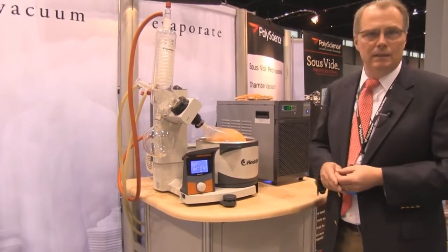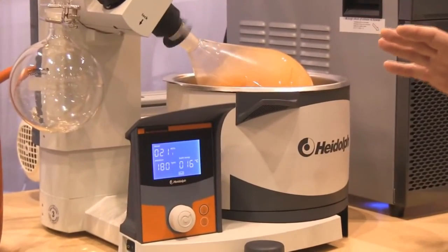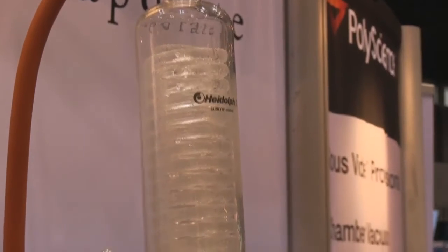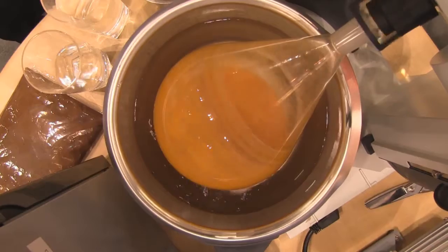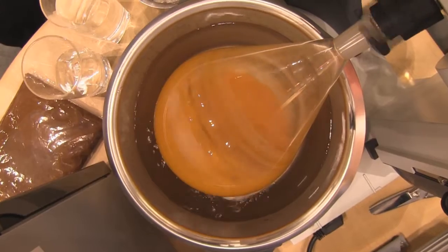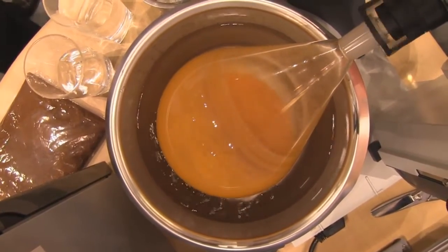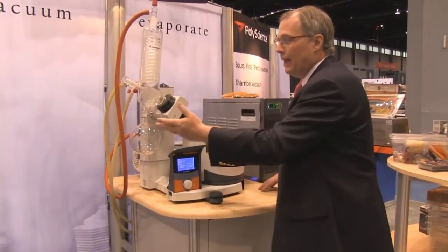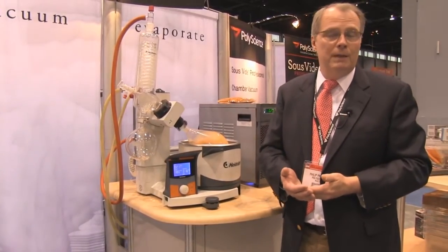Currently I'm distilling some habanero peppers. The system consists of a recirculating chiller that flows cold water through these coils, and a bath that's temperature controlled so you can keep an exact temperature of the product you're trying to distill. And because the whole system is under vacuum, you can boil even at low temperatures such as room temperature.